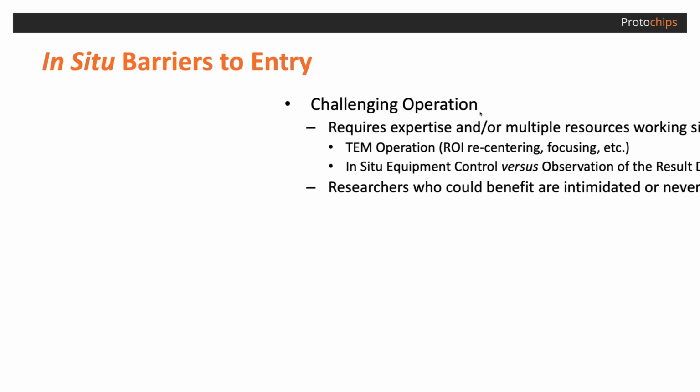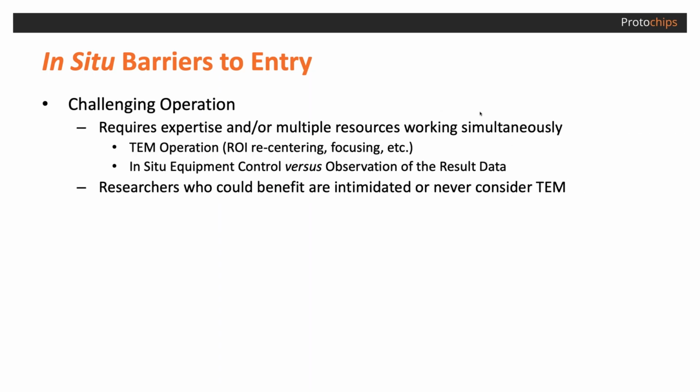When you turn your experiment into an in situ experiment, though, it becomes a lot worse. The whole point of in situ in many experiments is to incite bad behavior, to very aggressively heat and or place into a chemical, liquid, or gas environment a sample for the purpose of seeing how and if it changes or reacts. Those changes can usually lead to a great bit of instability.